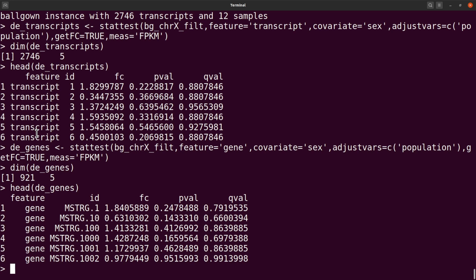Let me put it that way, because maybe you might want to do cross-references, or maybe you might want to look at whether particular transcripts are isoforms of a particular gene. We need to look at all these things, so we need to add that identifier. So we also get the gene names for this particular table. That is what we are going to do next.